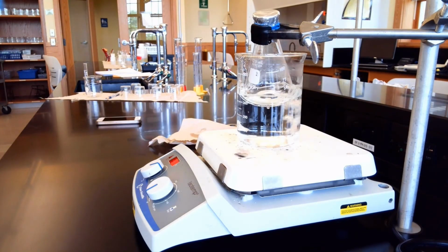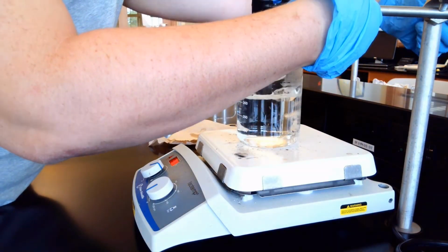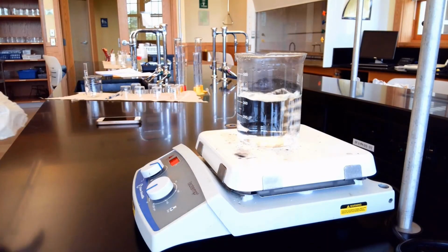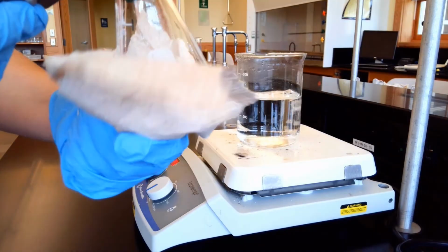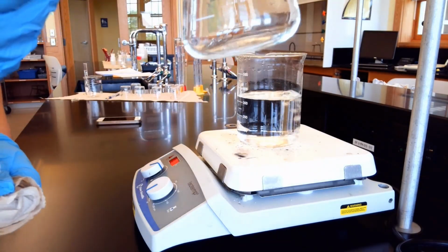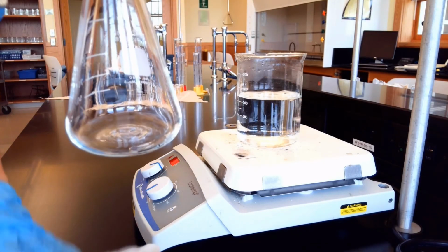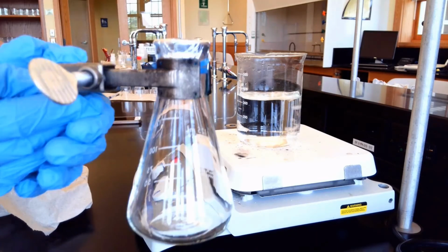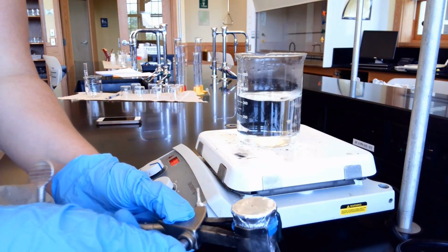Our second trial looks like it's done. I've stopped seeing steam come out, or vapor come out. So we're going to unhook this. Sorry, I'll flip it this way so we can see it. We're going to wipe it down. There's no more liquid inside, which is great. So what we're going to do is let this cool to room temperature, and then we are going to get the mass, and we'll go on to one more trial. So we're going to set this down to cool.